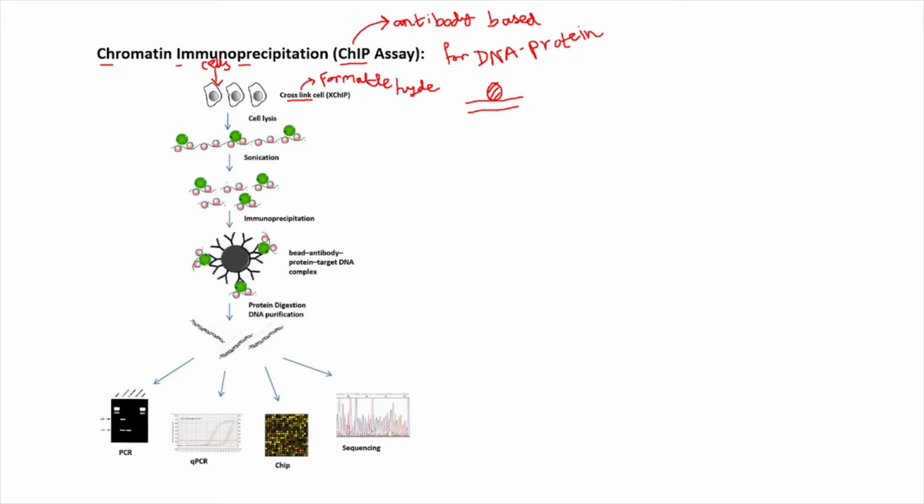You can use various sorts of lytic agents. If it is bacterial cells, you can use lysozyme. If it is fungal cells, you can use cellulase, chitinase, like that. So you can use various sorts of lytic agents for lysis of the cell walls and the cell membrane, which perform cell lysis, to lyse the cells and isolate the DNA, or here it is called chromatin.